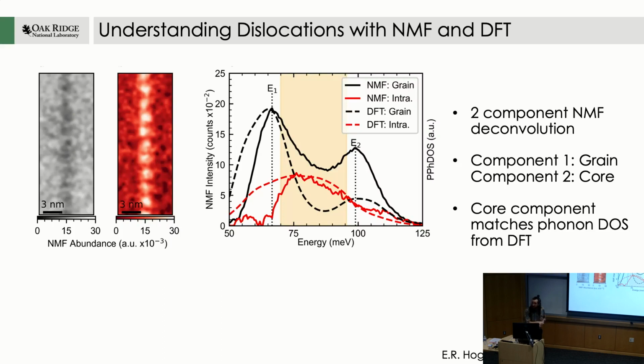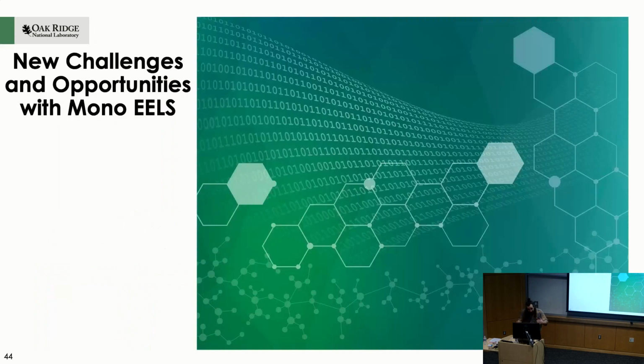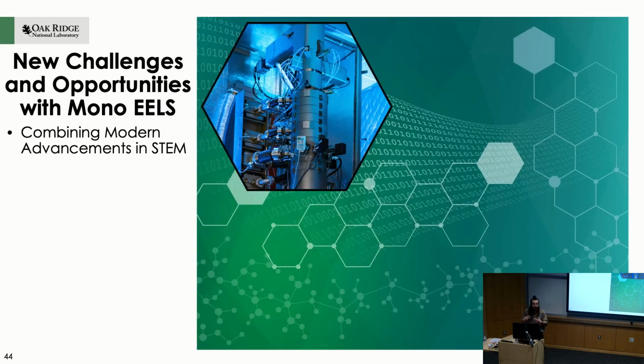It agrees really nicely. And then also because we have the theory, we can actually go to each eigenmode inside this vibrational band and map it out. So we can now look at individual vibrational modes inside dislocation cores and grain boundaries and really understand it and compare it to theory. So with that, I still have some time for questions, so I'll wrap up very quickly.